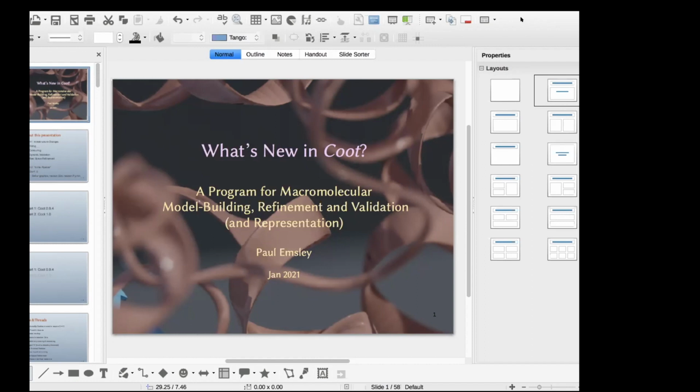Would we have chosen these little mesh things? I think ChimeraX is another great example of where you're headed, where we now take advantage of parallelism and modern GPUs to really do meaningful work and do more work faster. So I think it's great to see.